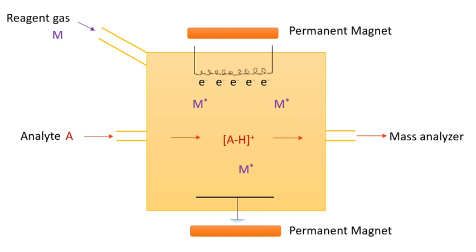Topic: Product ion formation. M + CH5⁺ → CH4 + MH⁺, protonation. A + CH3⁺ → CH4 + [A−H]⁺, hydride abstraction.